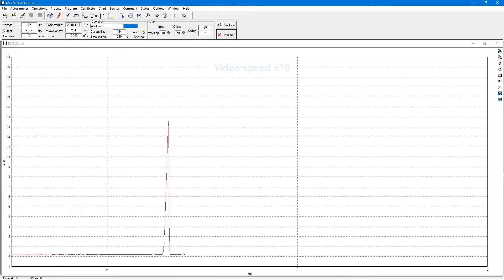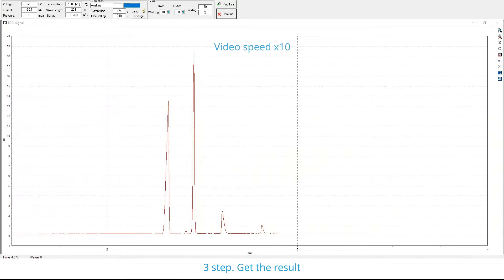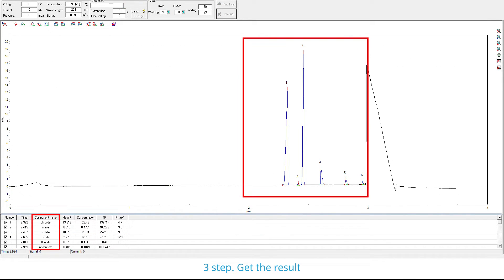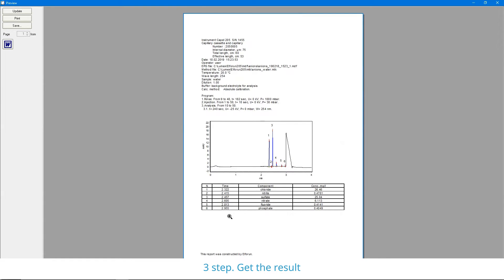The analysis is done. CAPEL 205 determines the concentration of six inorganic anions in water within just three minutes. You can save the obtained report on your PC and print.